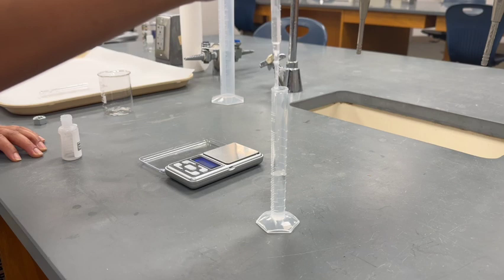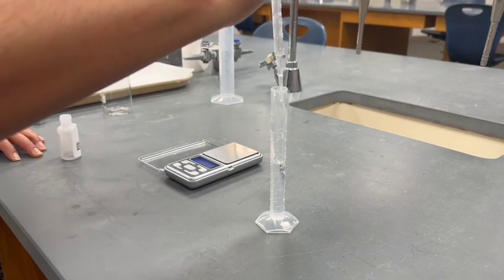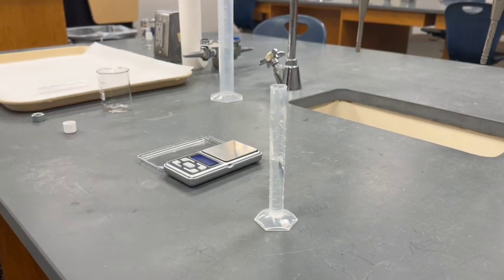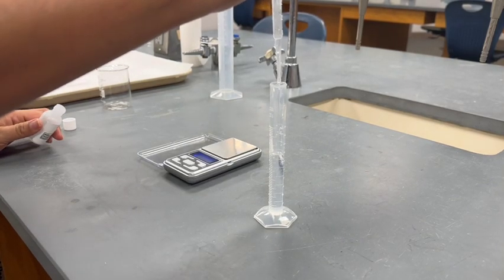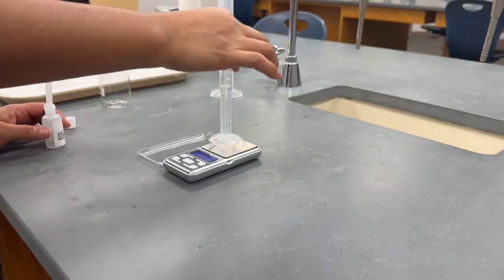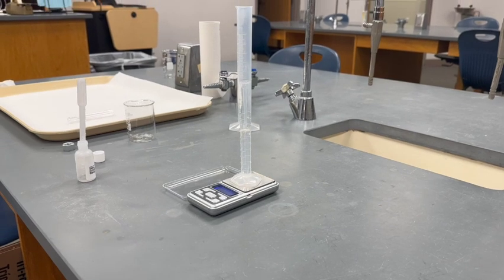For trial 3, add another 2 milliliters to the graduated cylinder and record the volume of unknown A — it should be around 7 milliliters. Place the graduated cylinder on the balance and record the mass. Calculate the mass of unknown A, trial 3, by subtracting the mass of the empty graduated cylinder from the mass of the graduated cylinder with unknown A. Calculate the density of unknown A, trial 3.